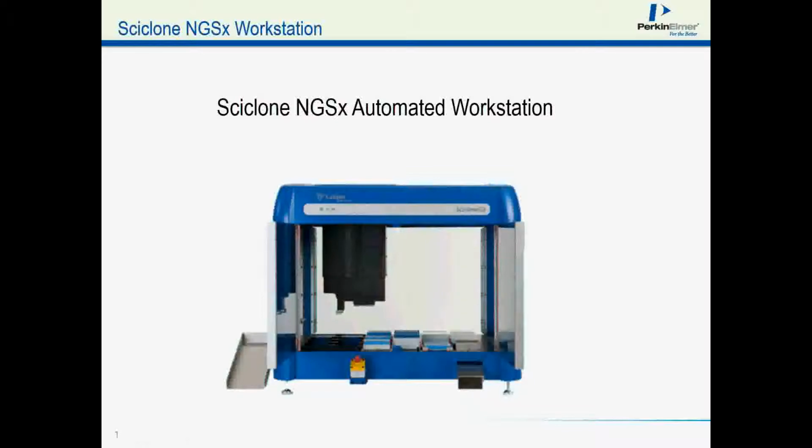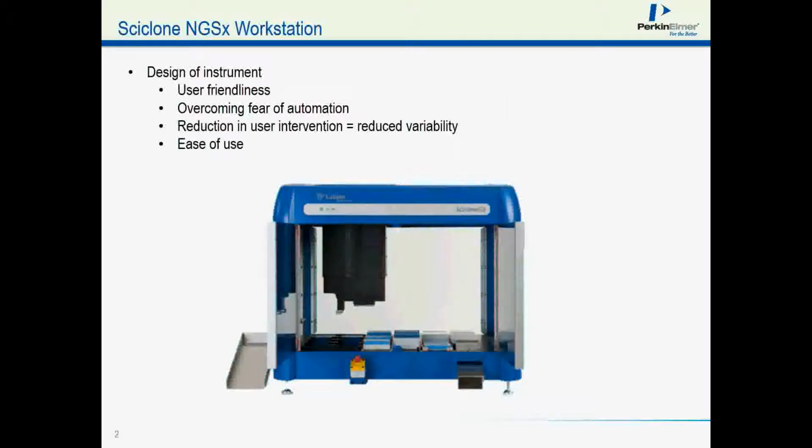Today I wanted to give you an introduction to the Sciclone NGS X, as well as the software that is used to control it. As you see in this particular slide, we have an image of the Sciclone NGS X.